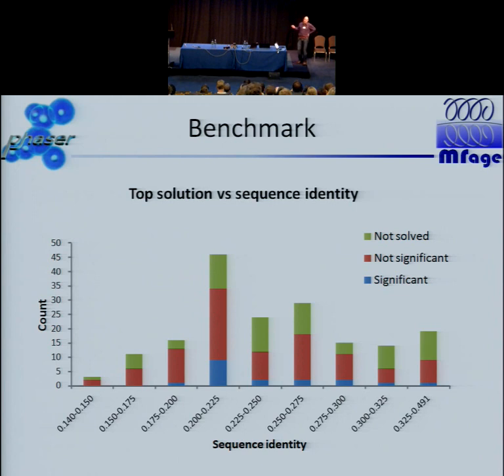However, if we switch on all these Sculptor template models, the blue ones indicate solutions when there is just one solution and it is a high Z-score, so it's very easy to identify. And the red one indicates cases when the top solution is the correct one. So these are the results we get. You can see that we actually managed to get rid of most of the green ones, and well, not all of them, unfortunately. But this is still a step in a good direction.